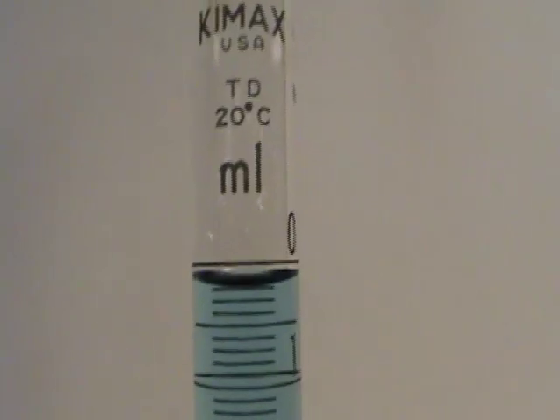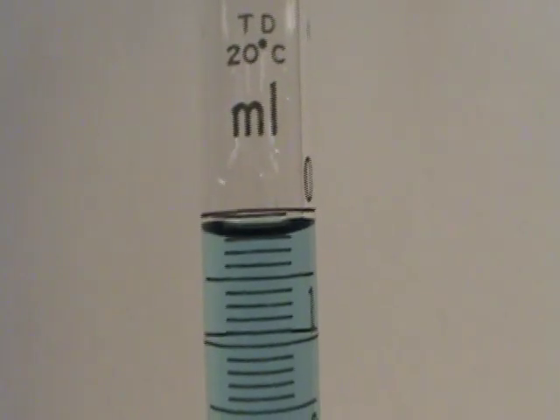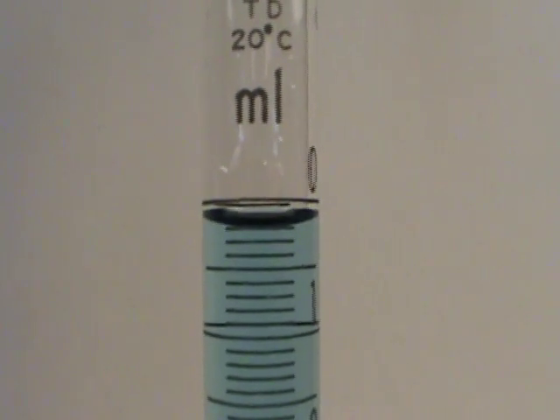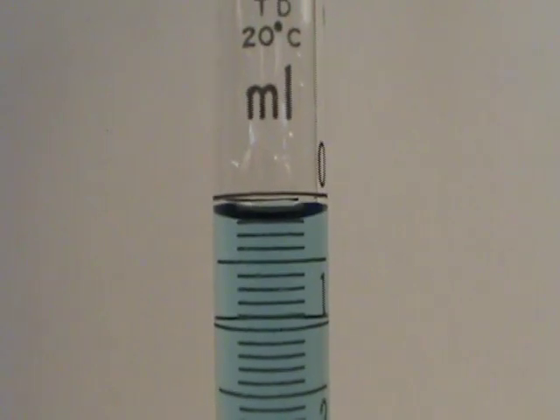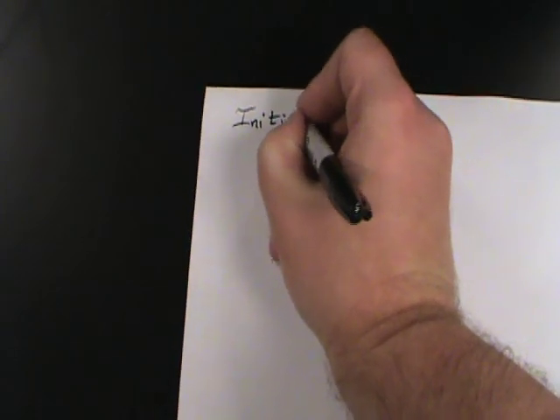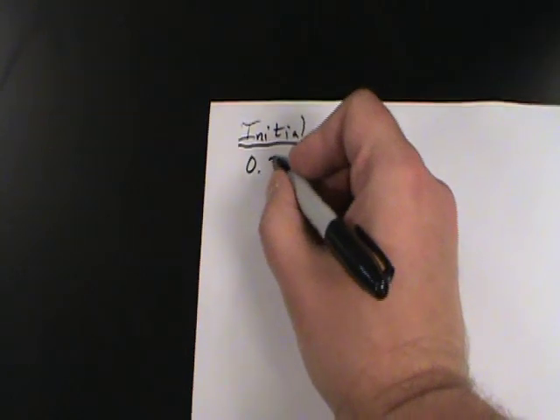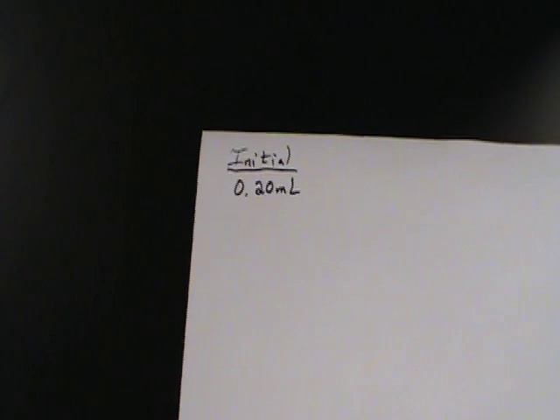So I would look at that and let's see if we can get a little closer. That looks like the liquid level is at exactly 0.20 milliliters. So let's take that initial reading — 0.20 milliliters is where we're going to start.